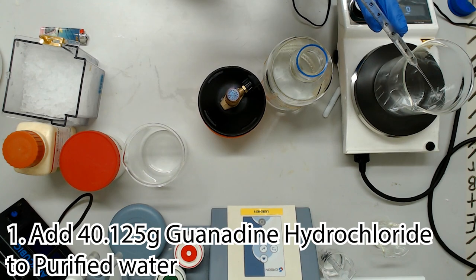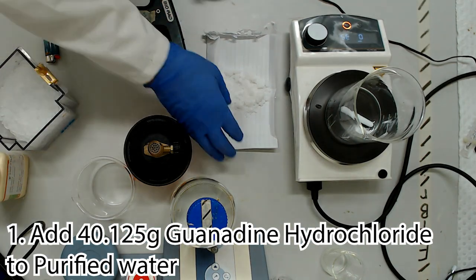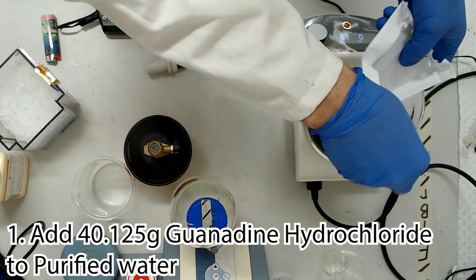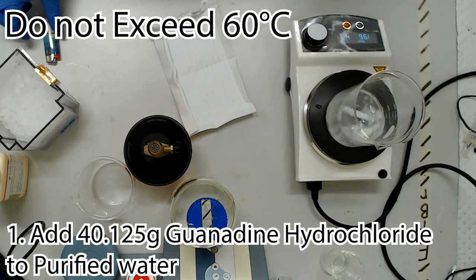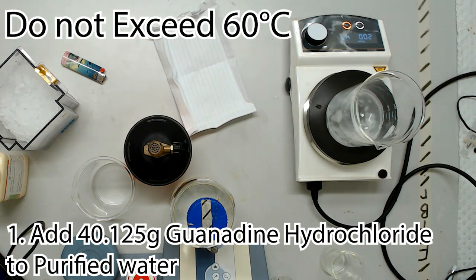Starting with 50ml of sterile purified water, we will slowly add 40.125 grams of guanidine hydrochloride to a beaker. This dissolution is very endothermic and without a heated stirrer can take a very long time. By gradually heating to no more than 60 degrees while gently stirring, this will take a lot less time. Keep the entire process as far away from your body as possible, and don't go peering over the beaker. Don't give up - you'll eventually be able to dissolve the entire quantity of salt. Patience is a virtue with this step.